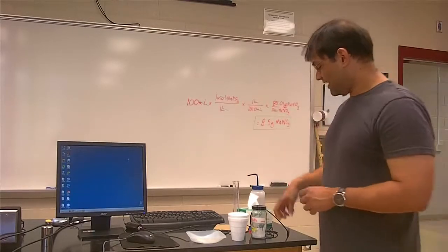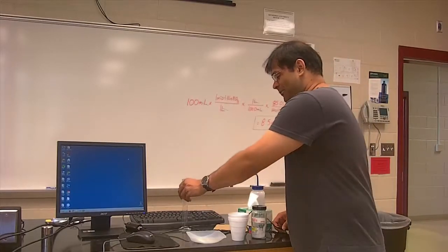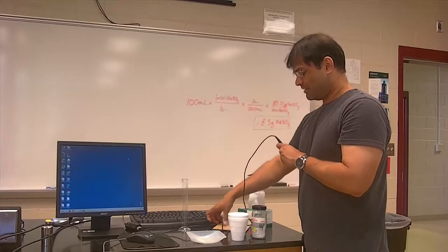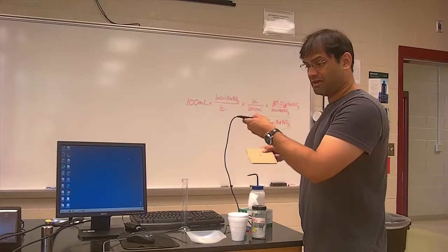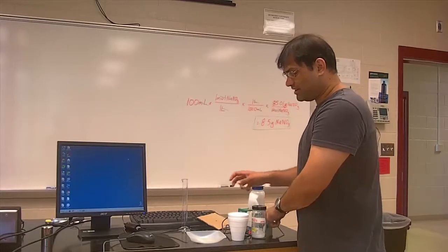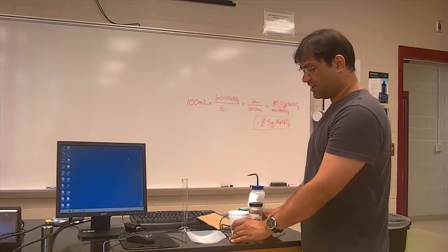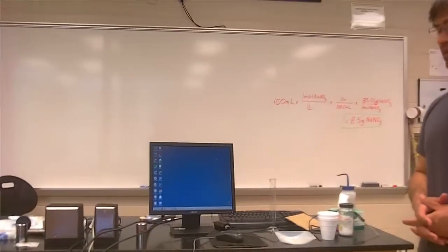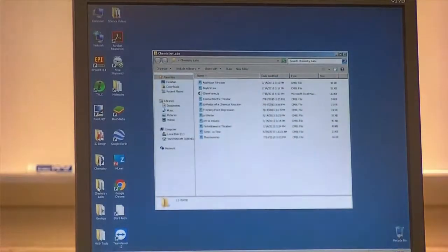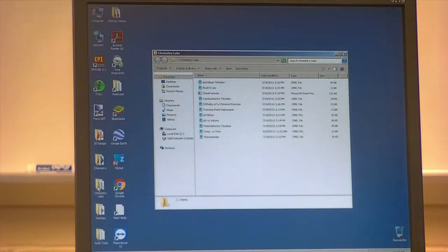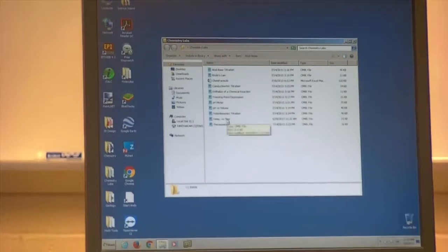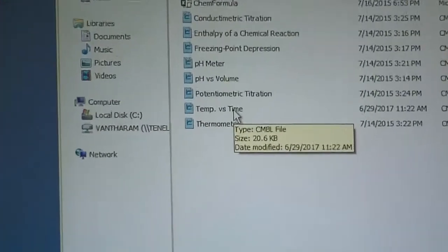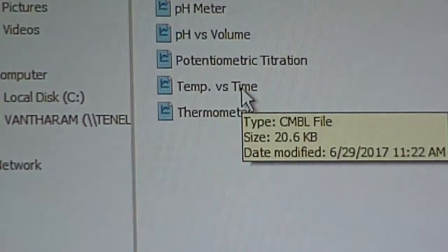I also have my temperature probe ready, my little lid to keep things insulated, and I'm pretty much ready to go for this experiment. Let's go to the computer. We click on chemistry labs — or something equivalently named at your lab station — and we're going to go to the program called temperature versus time.